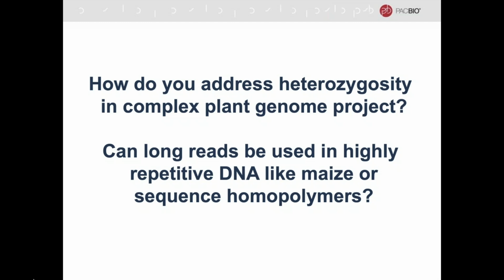So we've actually moved towards trying to bin our data sets into phased bins to do parallel assemblies, and we've found a lot of luck there. There have been a few studies that have come out where they've used trio binning, using Illumina sequencing of the parents to parse out reads into phase 1, phase 2 bins and then separately assemble. We're working with those, so we're interested in that.